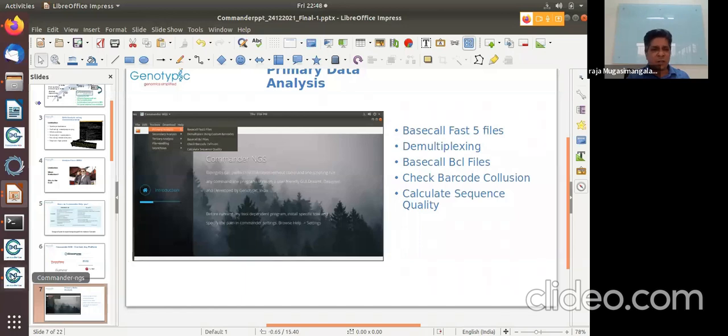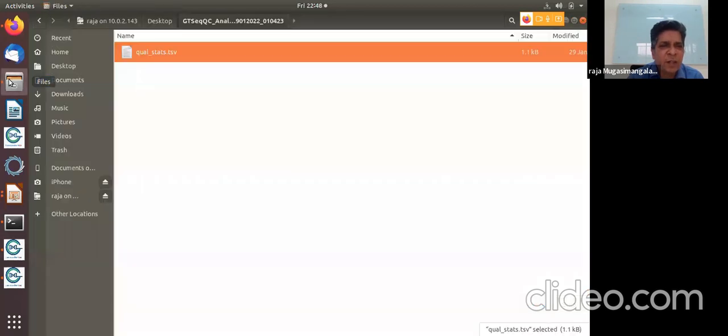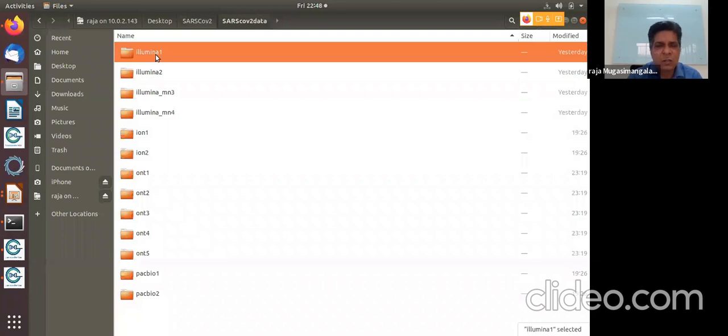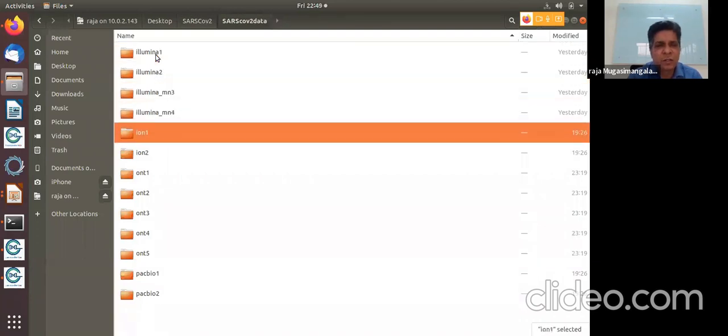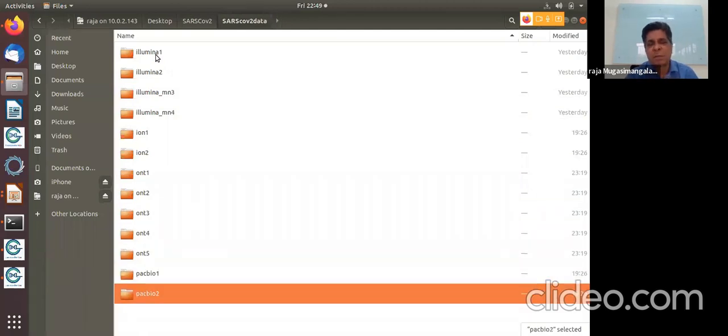Now let's go back to what's going on here. Okay, guys, COVID analysis successfully finished. It took 3 minutes. I'm going to show you the data, but I'll tell you, it took 3 minutes for, I think this is what we took, 1, 2, 3, 4, 5, 6, 7, 8, 9, 10, 11, 12. For 13 samples, it has finished in 3 minutes.